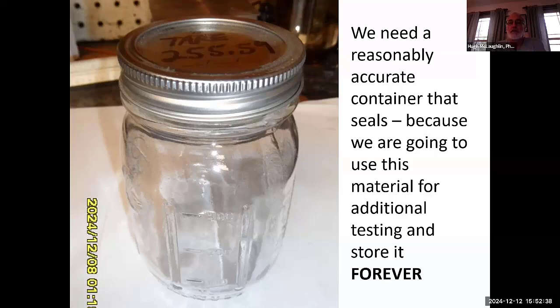Again, it's a sealed material, a container, because we're going to grab a sample as is and seal it up so it doesn't lose moisture before we measure the other properties. And the other thing I want to note, and I really urge you to take this jar of material, do some measurements as you take small amounts out to test things, but put that jar on the shelf and keep it for forever. Well, a long time, because if the biochar doesn't work correctly, maybe you want to do additional testing on it to find out what didn't work or what was missing.